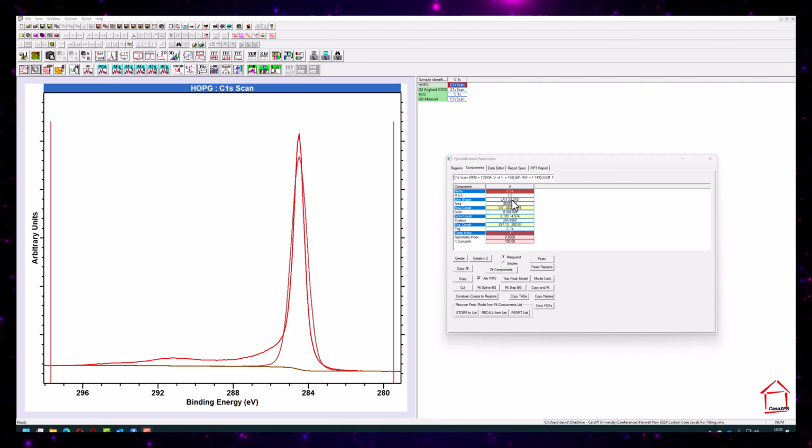So the LA line shape has 2 parameters that we can see here. So we've got LA, as I say, 1.53,243. The LA line shape is actually 3 parameters, but if we exclude the second parameter after this 1.53, then it takes the second number to be identical to this.